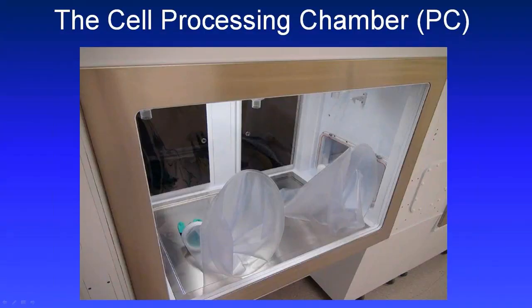So the next part of the Xvivo system that you come to is the processing chamber. The buffer chamber opens into the processing chamber, and these can be configured in a huge variety of ways.